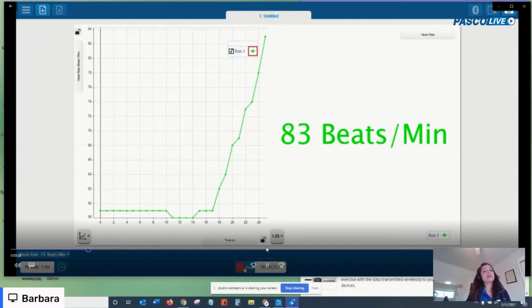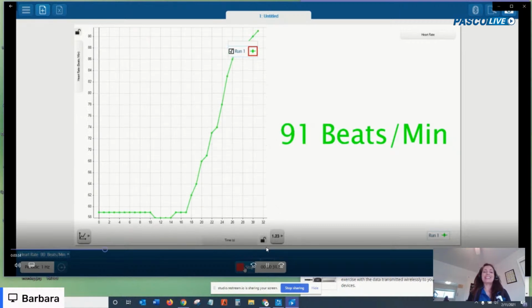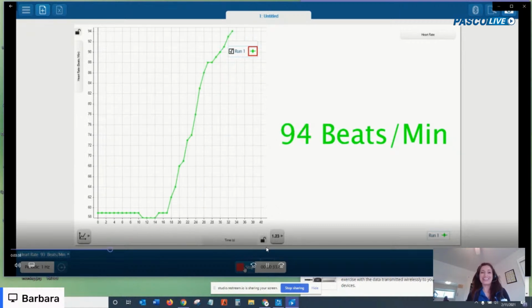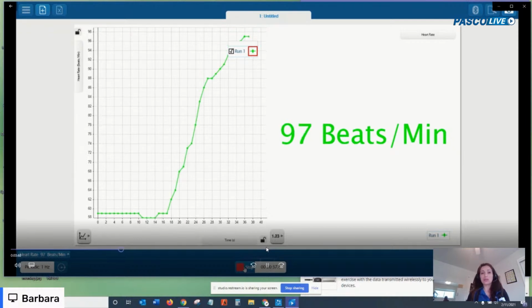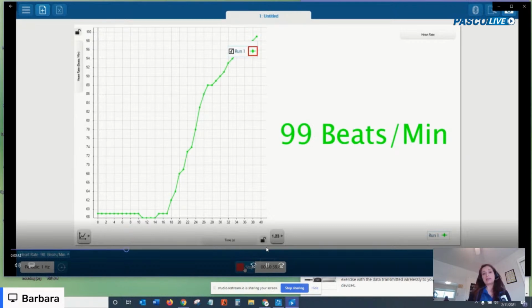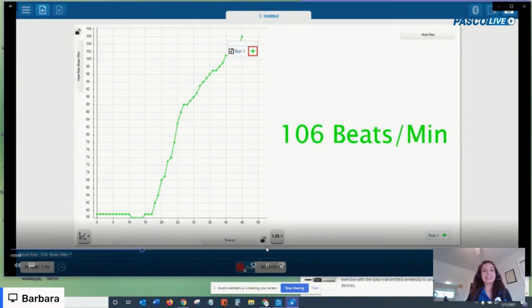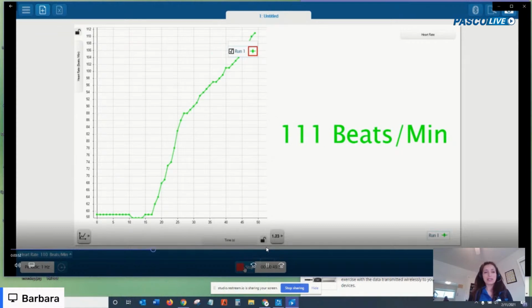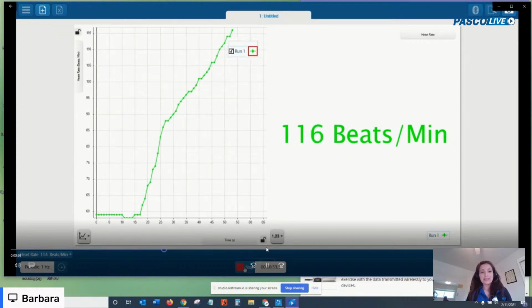And if I'm doing the lab activity that's associated with this, which I'll show you in 1 second, I'm going to keep running in place for 3 minutes at a pace where I won't pass out. So if you're doing this with students, you want to make sure your student groups pick someone who feels fit and good, where they can do 3 minutes of vigorous exercise without passing out. So I'm still running here. You can see my blood pressure, or my heart rate rather, is increasing.